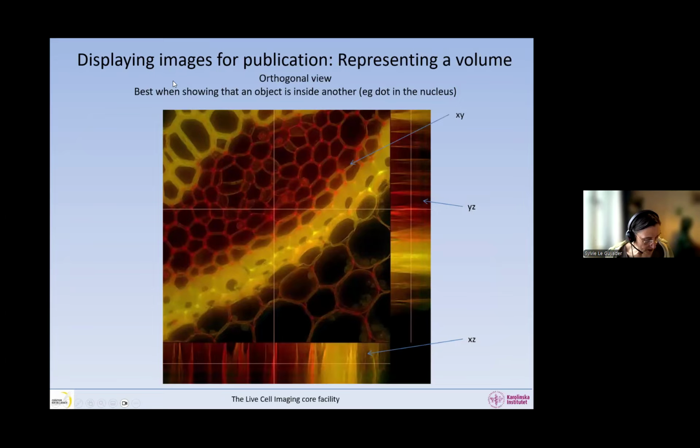When we want to display information about the images for publication, sometimes we have to represent different dimensions. So we have the color dimensions we have talked about. We can display the colors separately, the channels separately. But what do we do when we want to represent a volume?